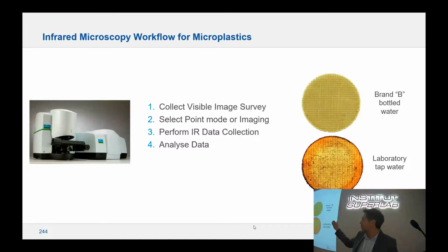But this is the workflow they went through. So you select whether you're doing point mode or imaging, you perform your IR data collection, then you analyze the data.